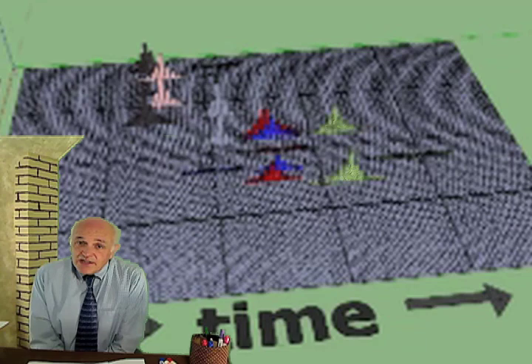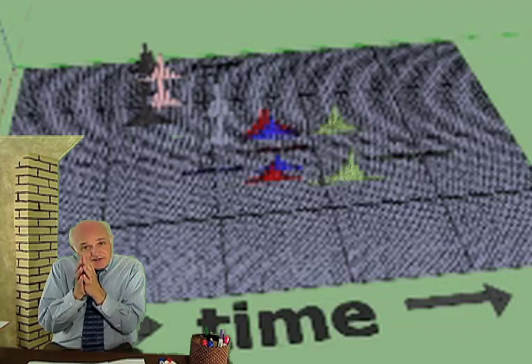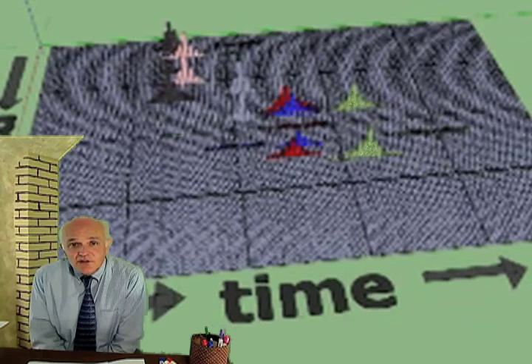So how does the calibration work? Well, the calibration is pretty much like other calibrations. We give it a standard, and we say, okay, we want this to be the standard. Then the boxes are lined up according to the standard. It works a little bit like calibrating your bathroom scale. You get home from the gym, and you know with your clothes on, you weigh 190. You get on your bathroom scale, and it says 196.